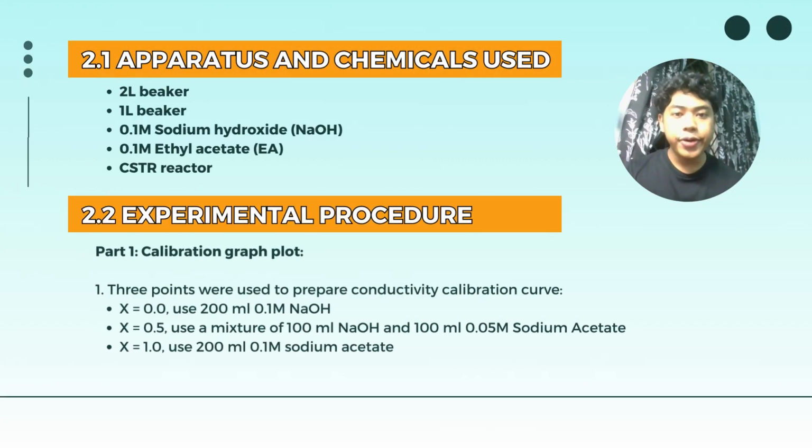Here are the apparatus and chemicals used: 2 liter beaker, 1 liter beaker, 0.1 M sodium hydroxide, 0.1 M ethyl acetate, and CSTR reactor.